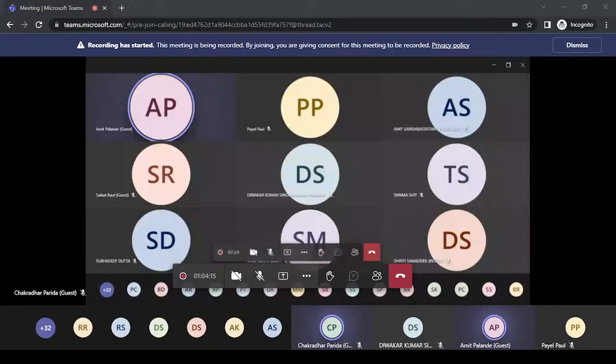Then after the fingerprints, you can go for different class of compound studies also. There are 14 different classes of compounds: alkaloids, phenols, tannins, terpenoids, coumarins, steroids, sterols. For each class of compounds, by using the different derivatizing reagents, you will get these beautiful colorful bands for the class of compounds.